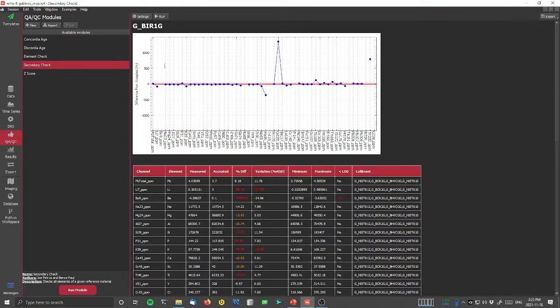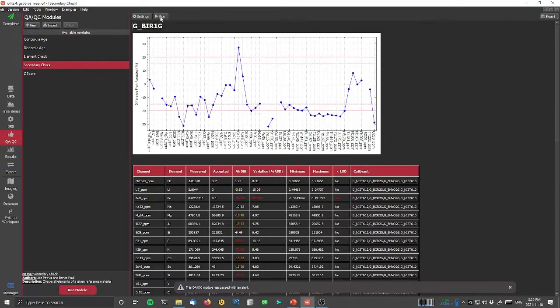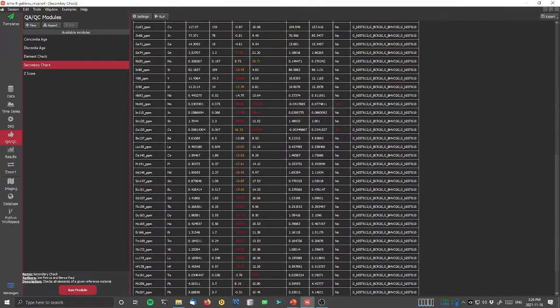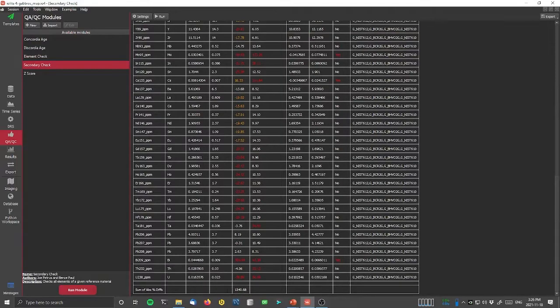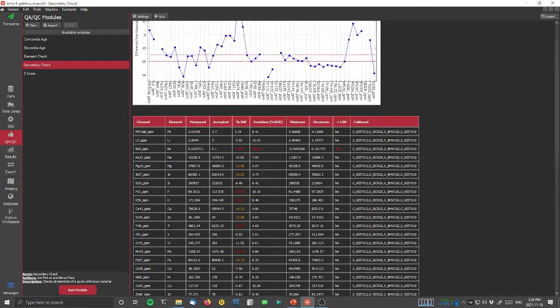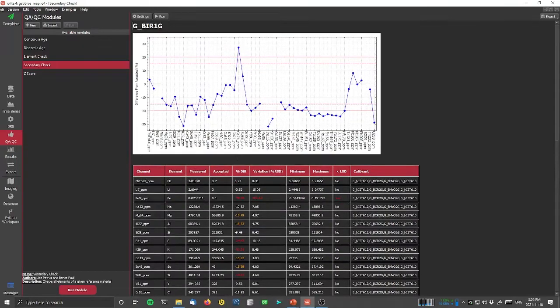So to get our updated results, we're just going to click this run button again, and you can see that forcing through 0 has made a big difference to our accuracy. Without going through each individual channel, we can just look at this summary value down the bottom here, where we've gone from tens of thousands down to about 1,300. So forcing the fit through 0 was actually quite advantageous for us.